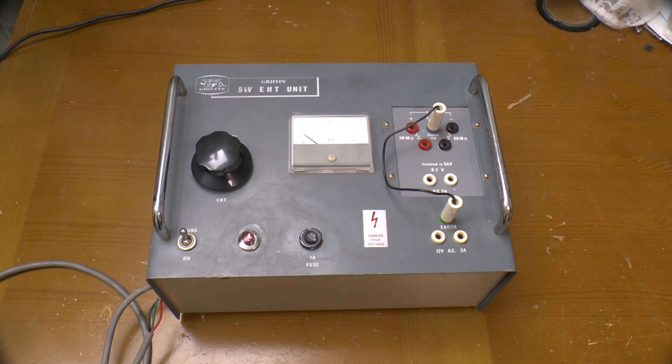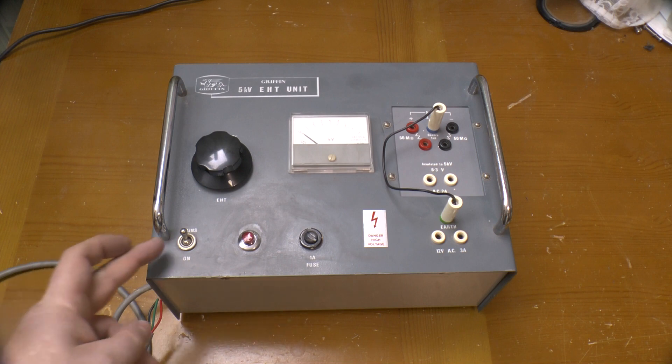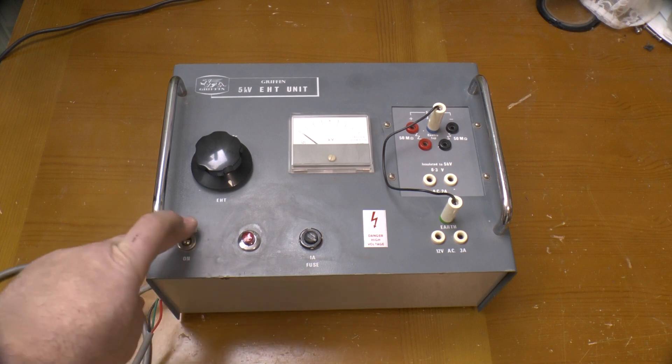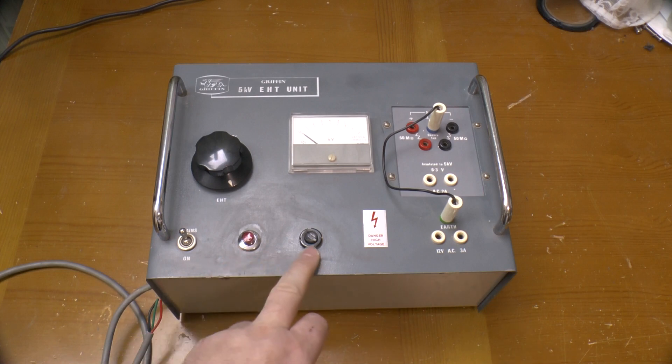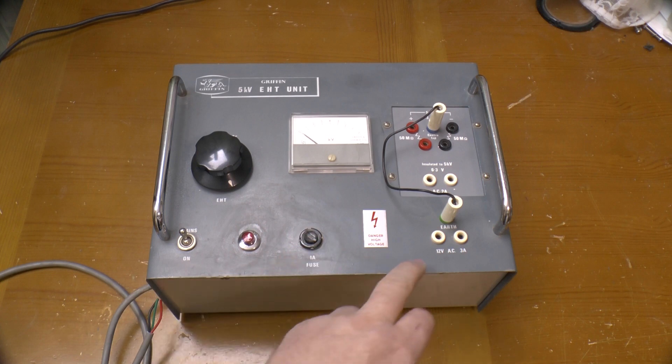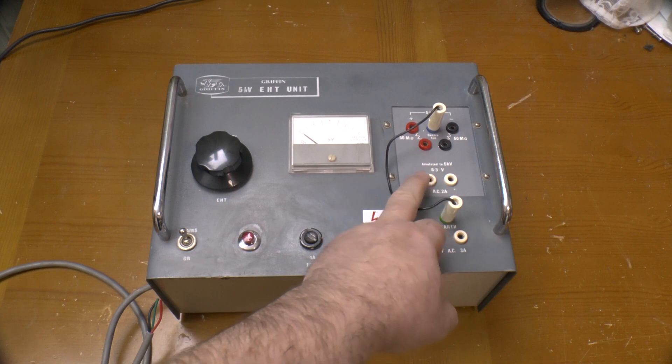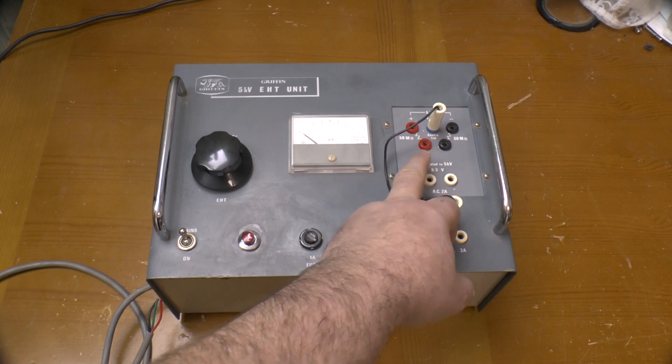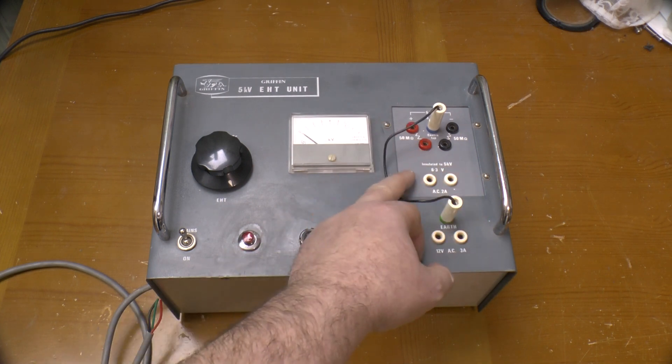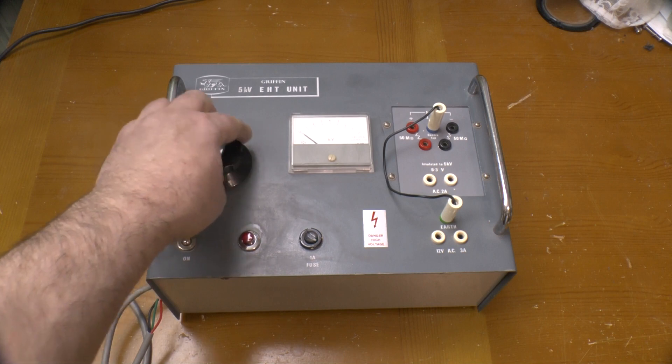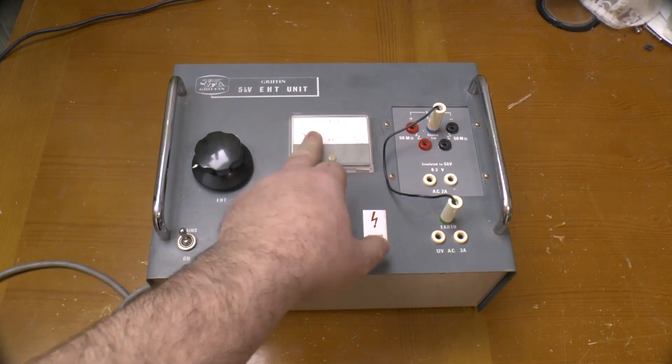It seems in pretty good condition on the outside, at least, apart from the switch being broken. I need to take a look at that. Next to the switch there's a neon power indicator and a fuse holder with a one amp fuse. Elsewhere on the front there are terminals for a center tap supply of up to 5000 volts with or without an additional 50 megaohms of resistance on each side. There's a control knob to adjust the voltage and a meter to show what it's up to.